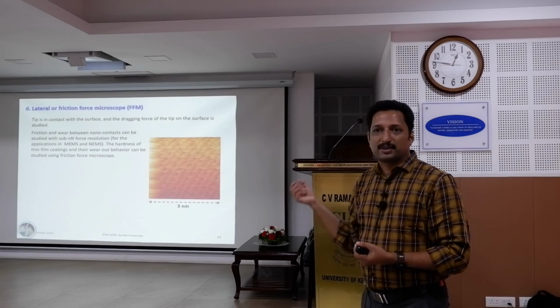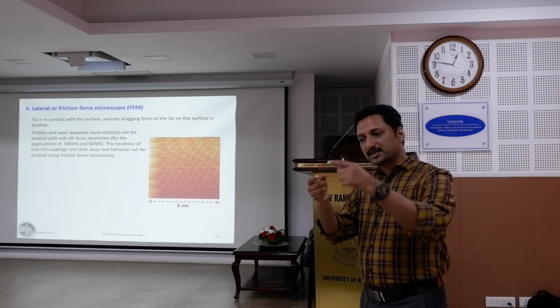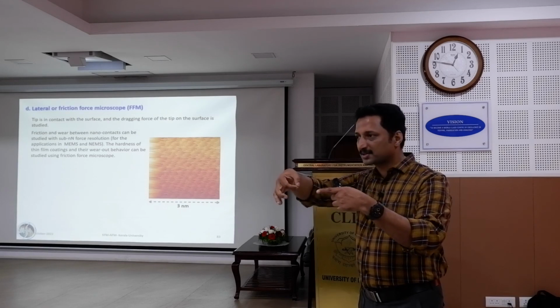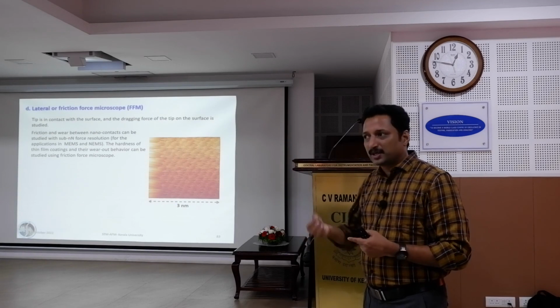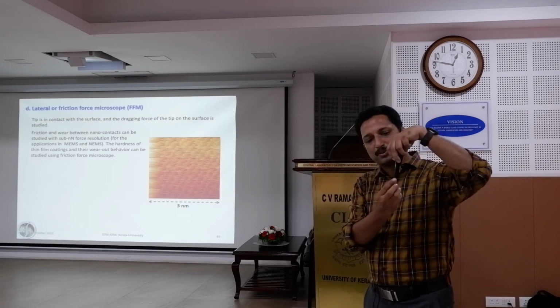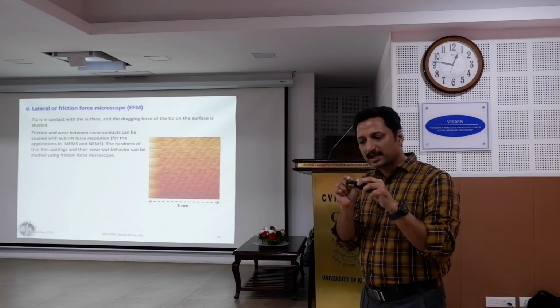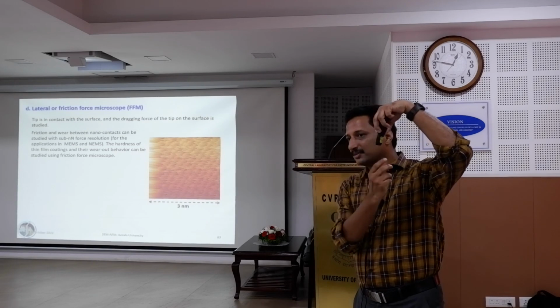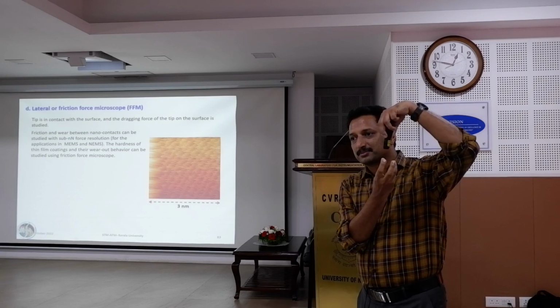Also, another work in this case is to take one strand of DNA, fix it on the surface, and pull another strand by the AFM tip. How do you pull it? At the end of the AFM tip, you can put a carbon nanotube. In a microscope, you can actually put a carbon nanotube at the end. A carbon nanotube has an open end with dangling carbon bonds. You can attach an antigen there or an antibody.